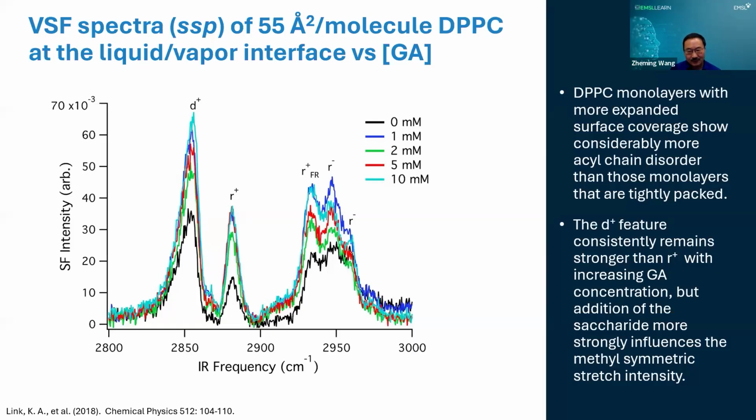monolayers change from the two-dimensional solid form to the liquid condensed phase, they have way more different conformations. Basically, those alkyl groups can have different conformations and orientations there, and they change as the concentration increases. And I didn't show here, of course, they will change more significantly as the amide small molecules' protonation status and concentration change.